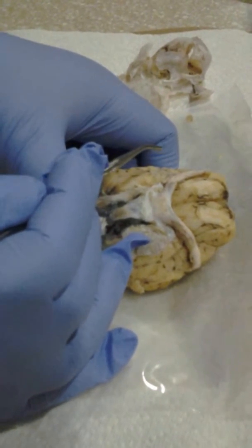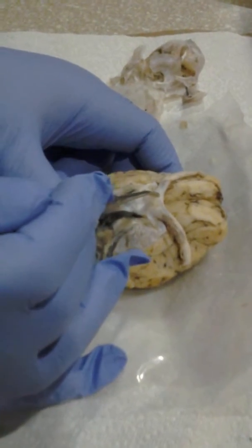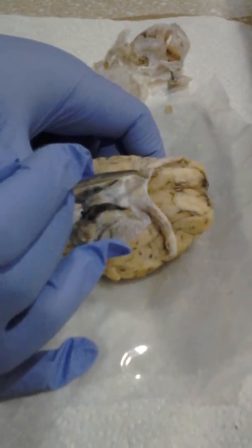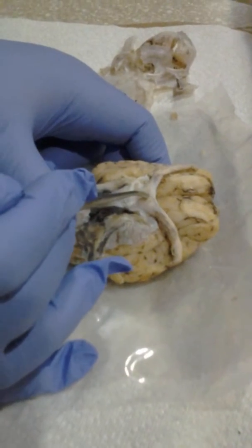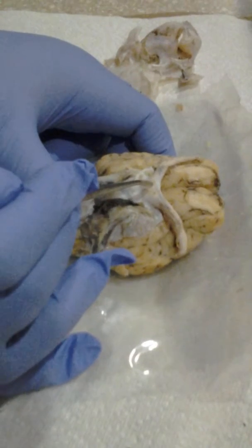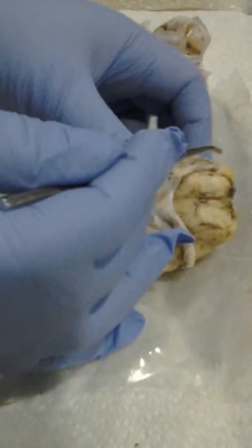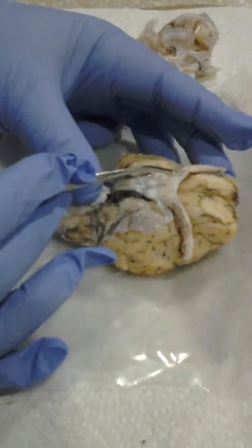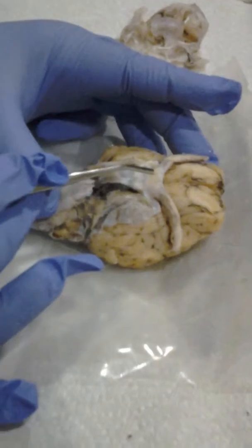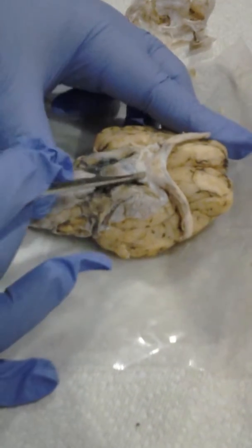And then we have the optic chiasma here. And then we have the optic nerve 2 here. And just below it is the optic tract, which should be in this area here underneath the sheet.